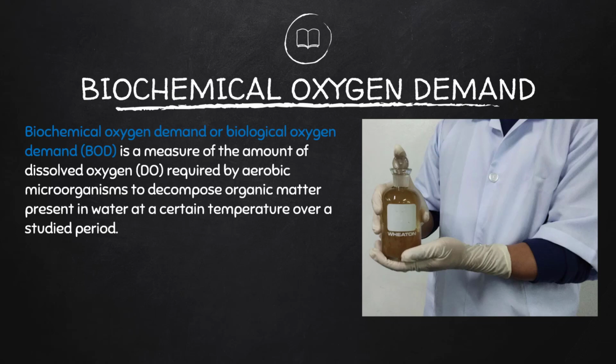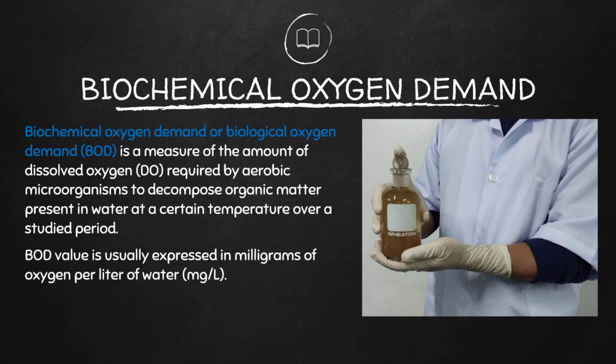Normally, we study BOD levels in a span of 5 days because in that case, the microorganisms have already completely decomposed organic matters present in the water. BOD value is usually expressed in milligrams of oxygen per liter of water.